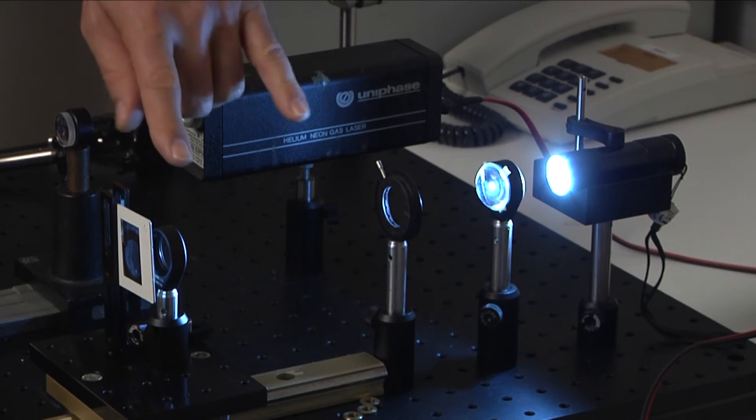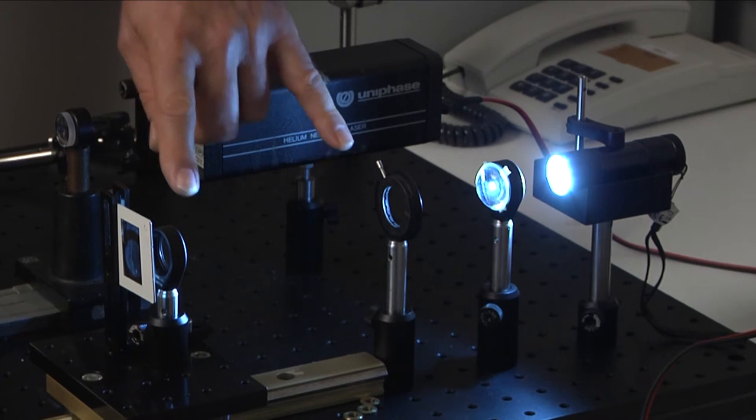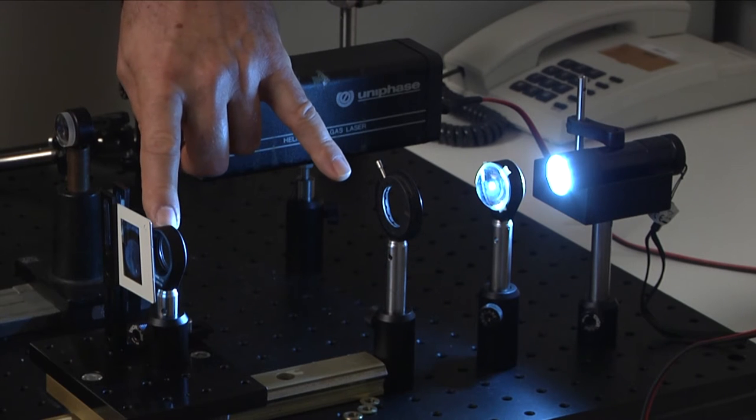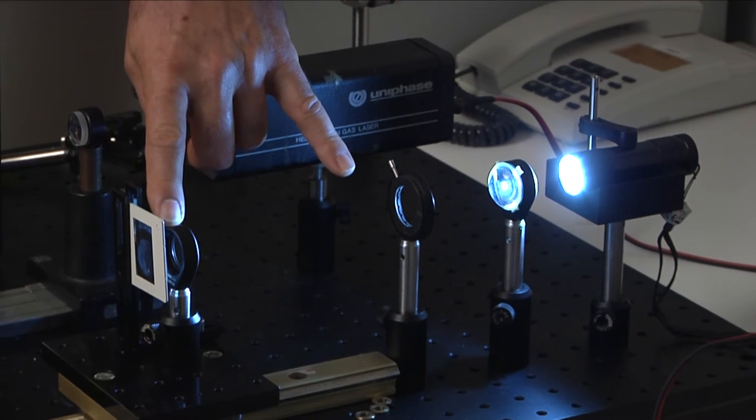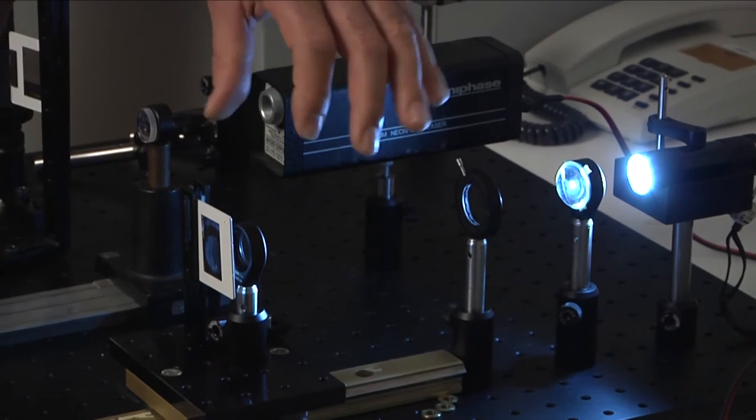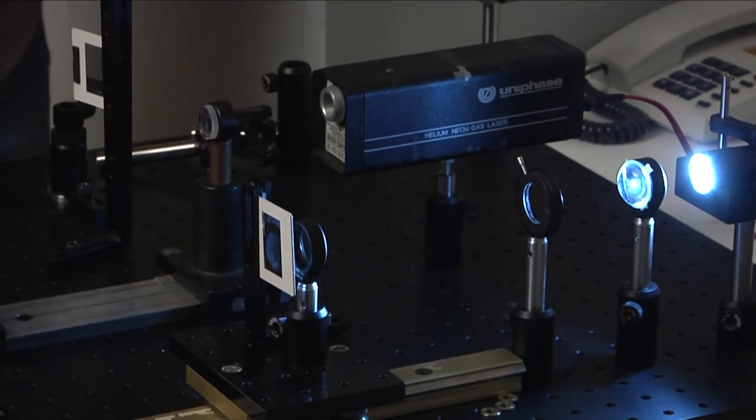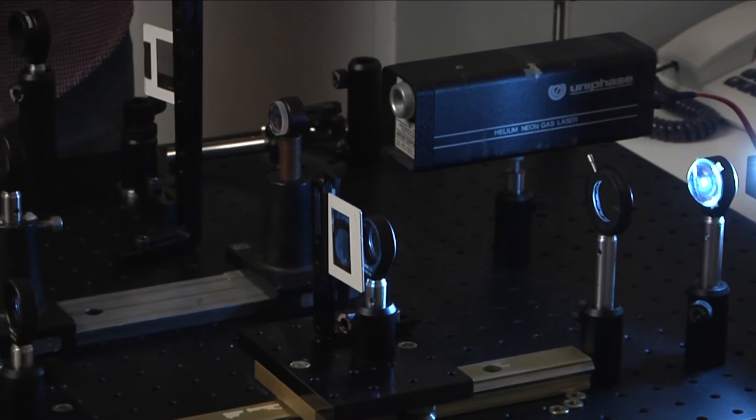This image is located at the focal distance of this lens, which is, in this case, 15 cm. And after this lens, on the sample, we will have a parallel beam of light.